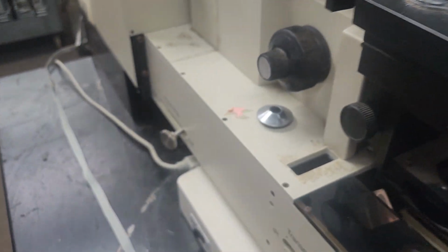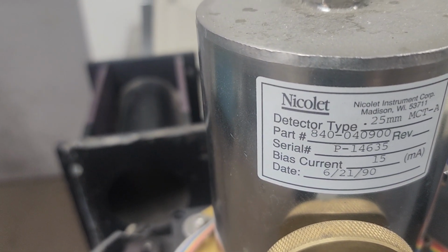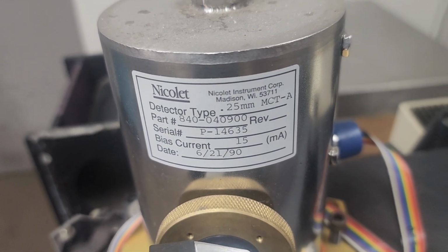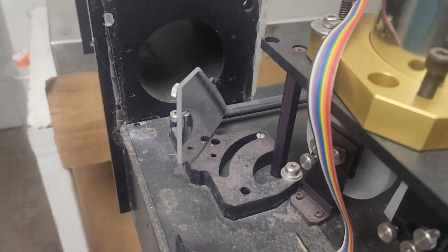But the infrared portion of this, I think, is the back half of it. And this looks to be the power or serial port. And this is just sitting on here, so I'll pop this open. But Nicolet detector type. That gives you a waveform, I guess. Then it's got some refracting and there's a lens there.